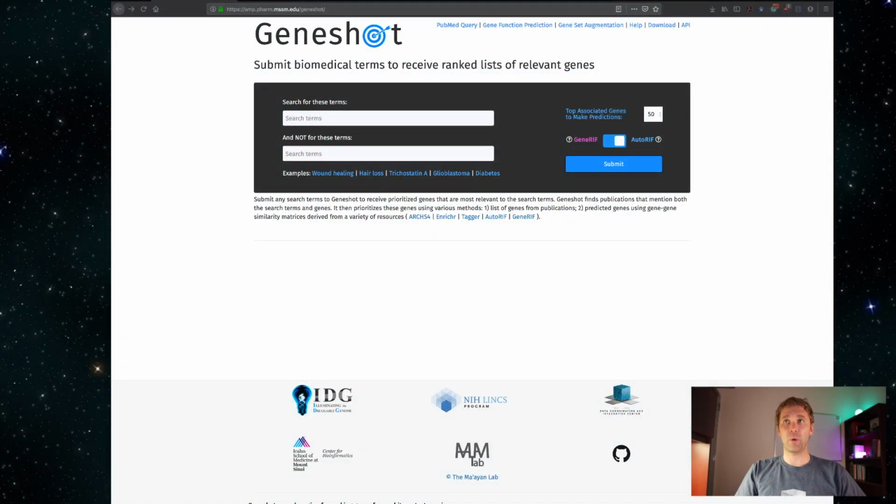This is the starting website of Geneshot. And what you can see here is that we have two fields. We have search terms, and then we have not search terms. So you can specify things that you don't want to look at. So we keep it simple, and we just search for one of the examples that we put in here, but in this field you can type anything you want.